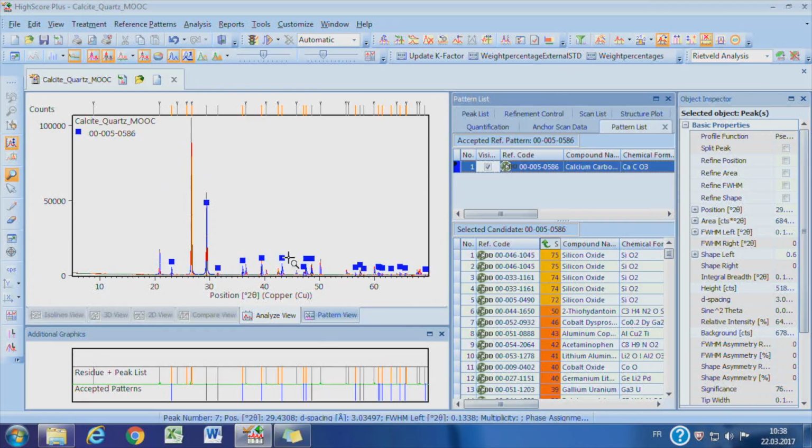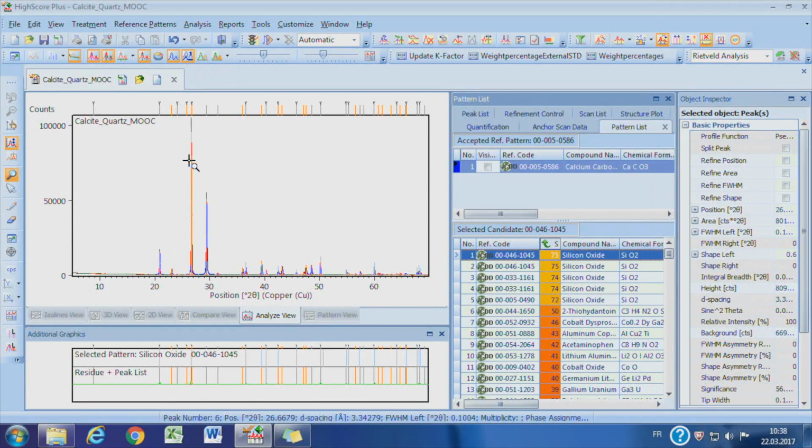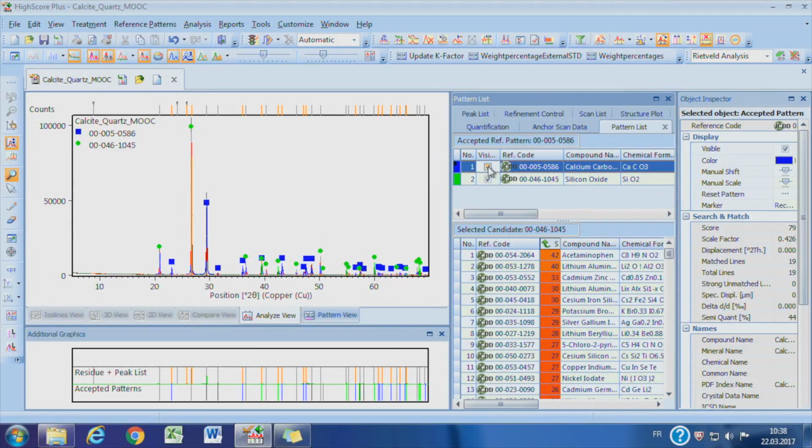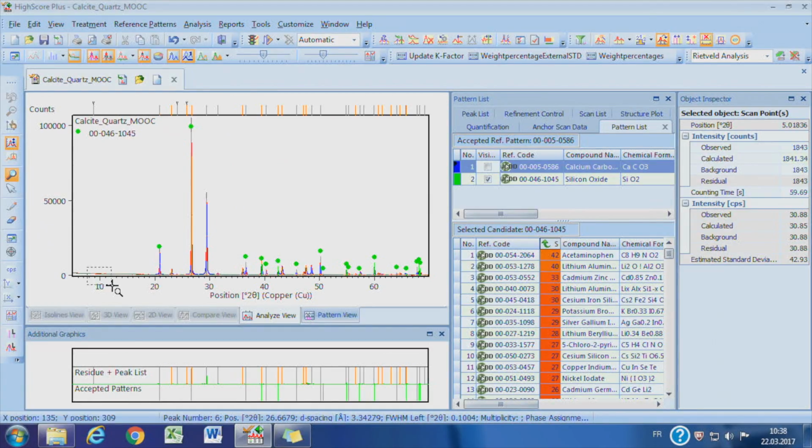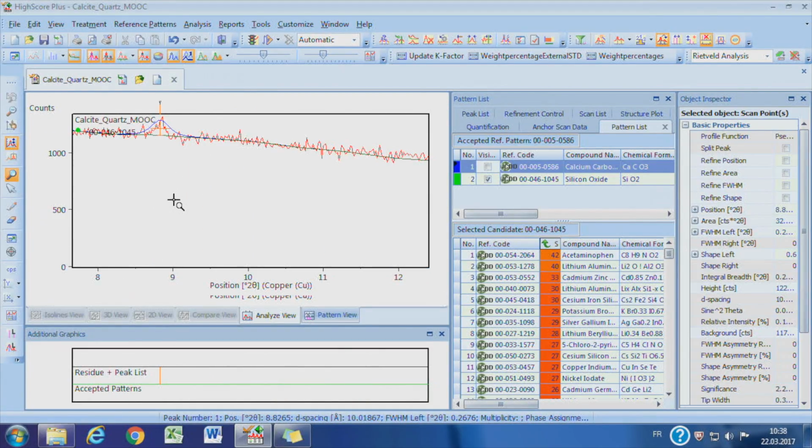After taking the next candidate, quartz, most of the peaks are identified. For each phase we picked, it is recommended to check the relative strength match by eye, focusing on the 3 strongest peaks. The remaining tiny peaks are from the K-beta residue.